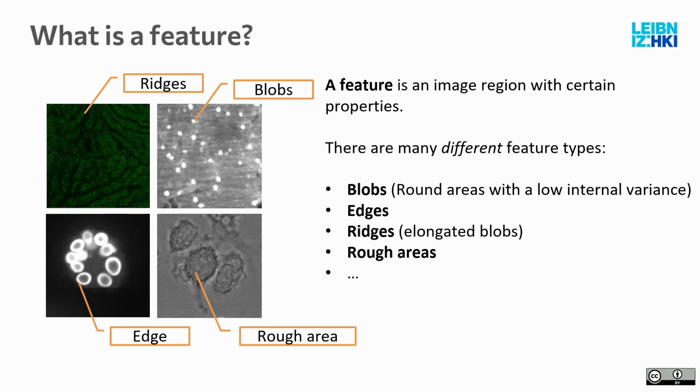And I have here four of these commonly encountered features that you will find in images listed. So ridges, blobs, edges, and rough areas, or texture-based areas. And I will go through them one by one, so don't worry about this overview.